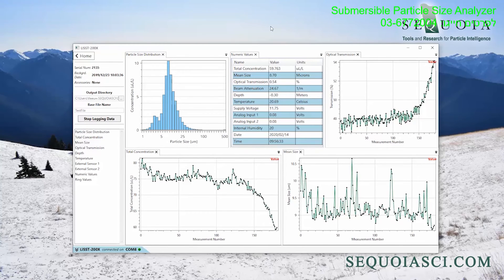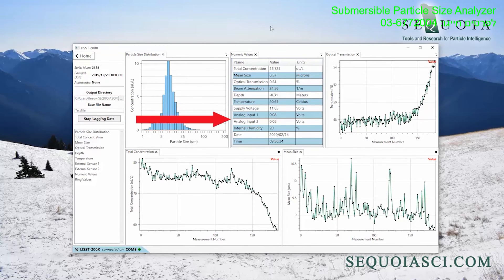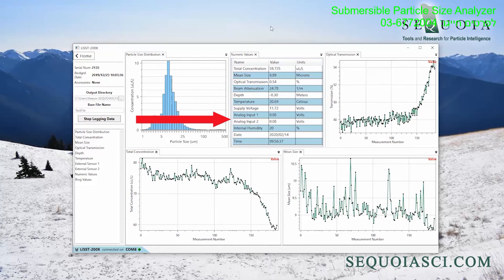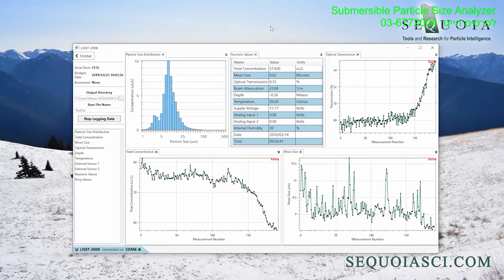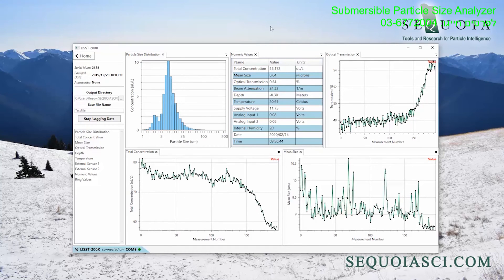Finally, the LIS200X can integrate up to three external analog sensors that are all powered by the LIS200X. The signals from the external analog sensors are embedded in the standard LIS200X data file.